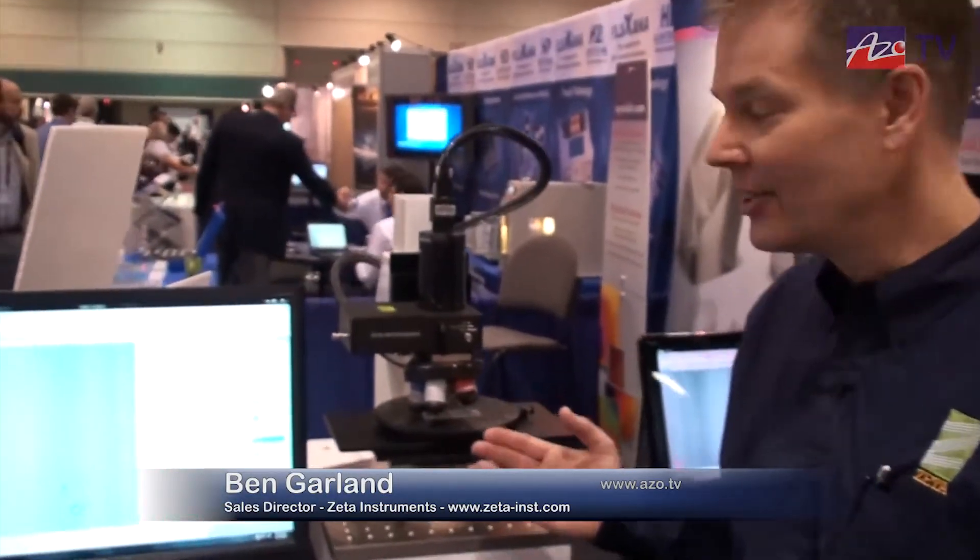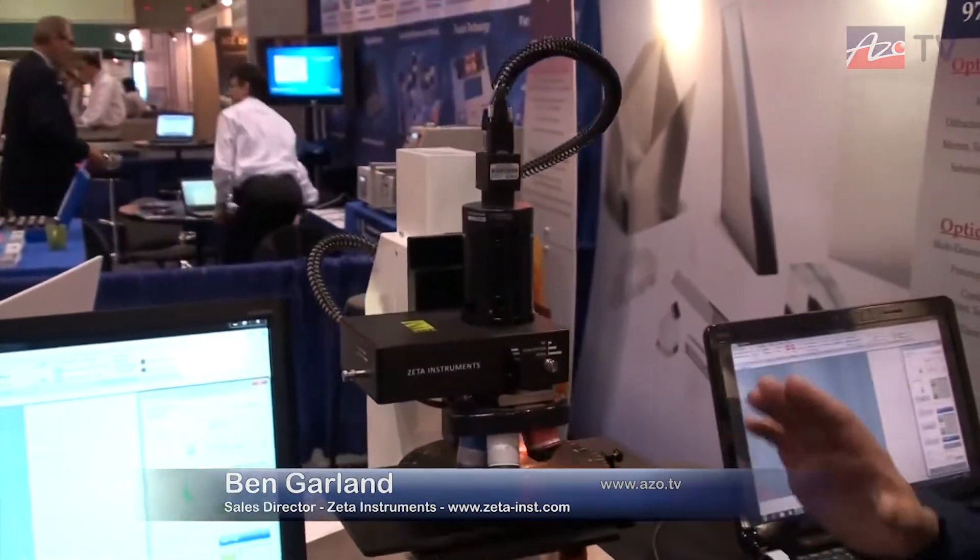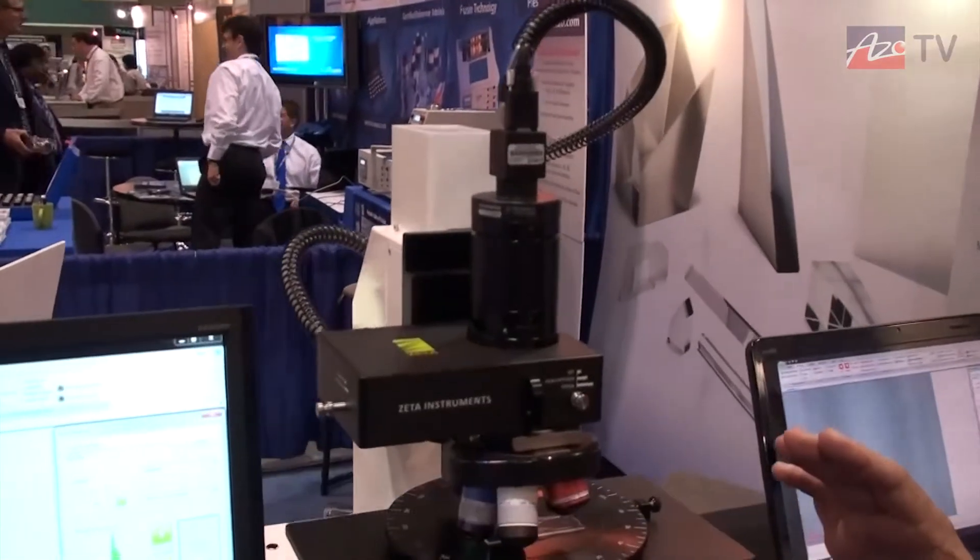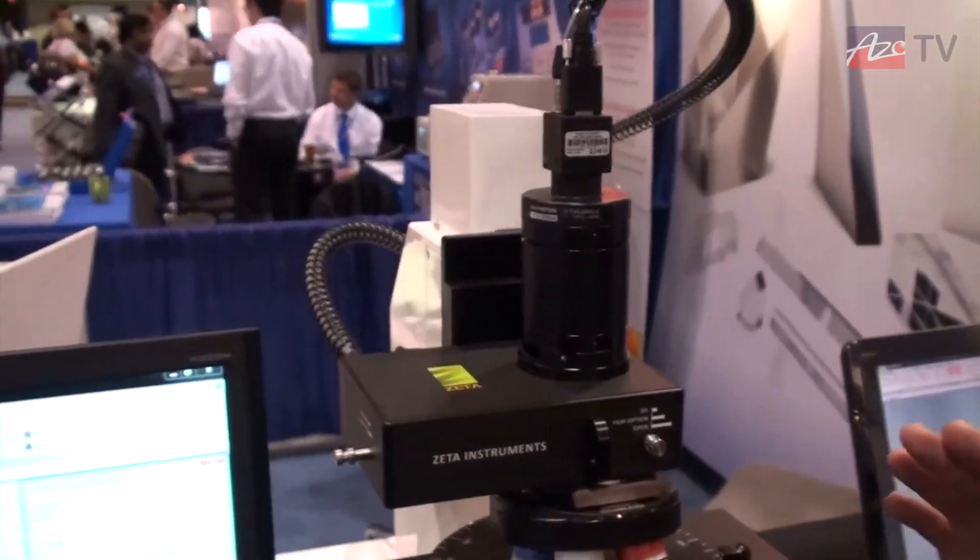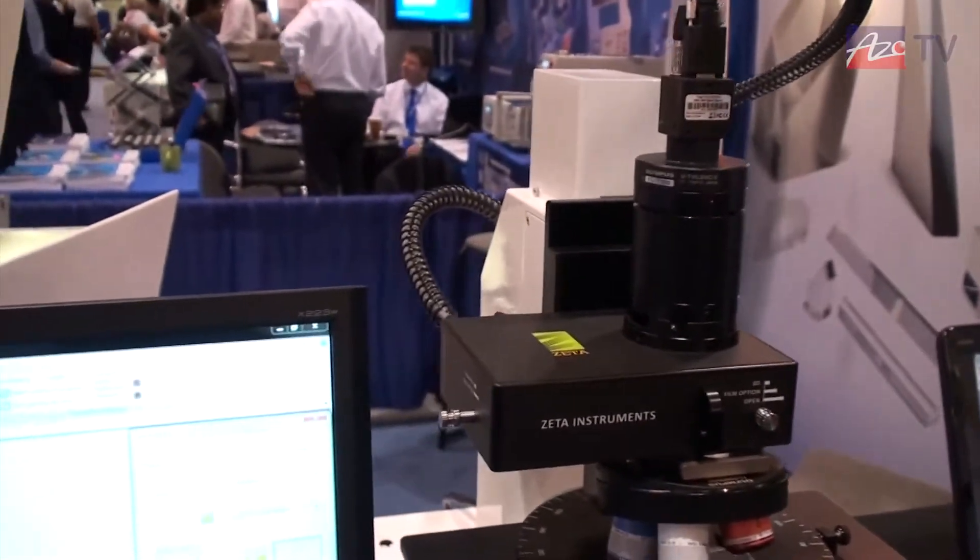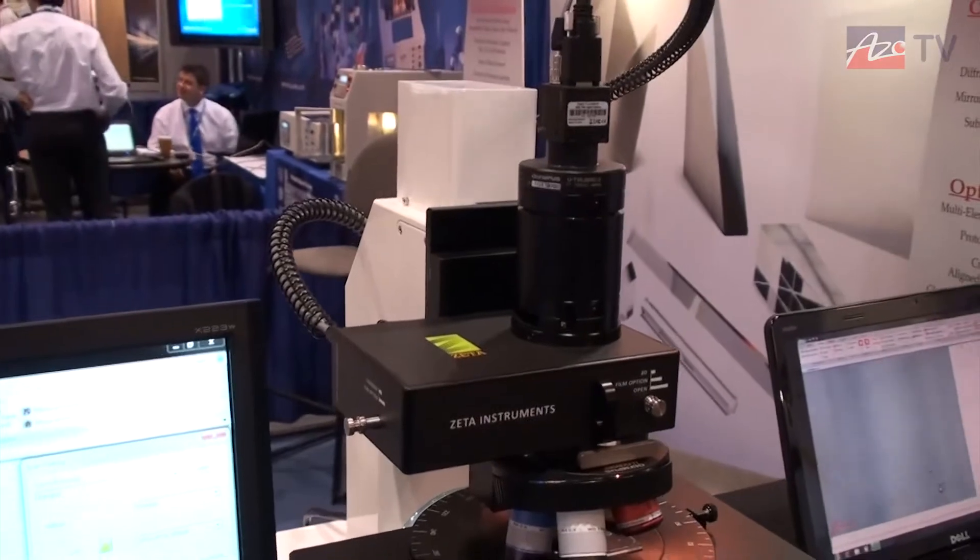We have a previous video that describes a little bit more about the technology, but it's an optical profiler. It's analogous to a laser confocal microscope system, but our technology is a bit different. It employs what's called our ZDOT technology.